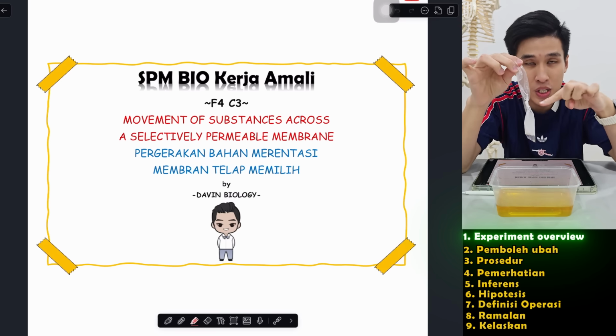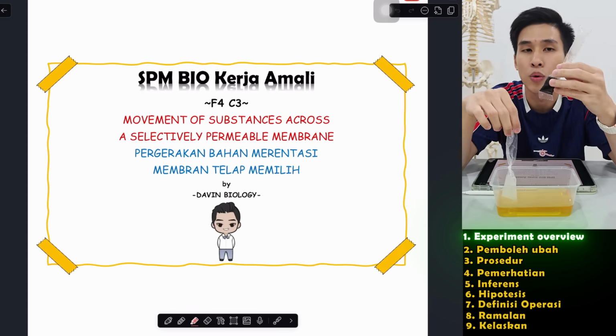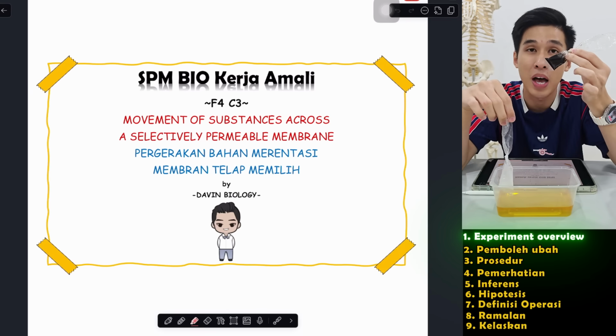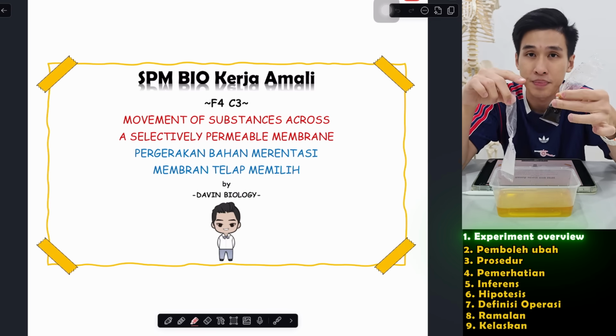So when iodine goes inside, it will react with the kanji and menghasilkan larutan biru tua lah, we will say, become dark blue. That's what happened when iodine reacts with kanji. So this is your end result. Okay, this is what will happen.